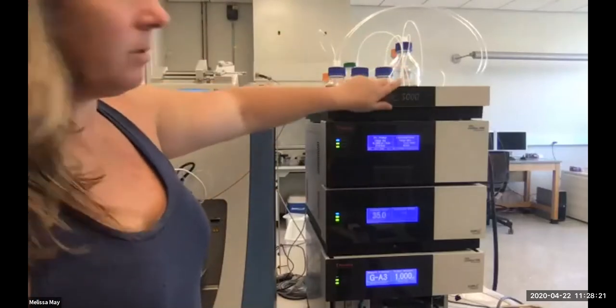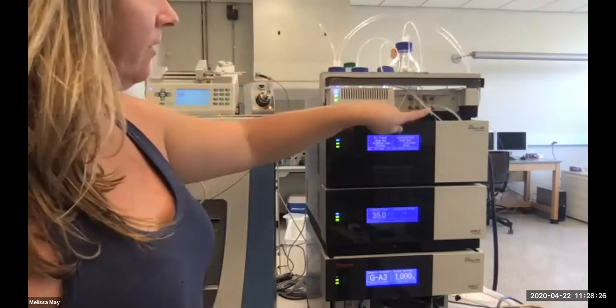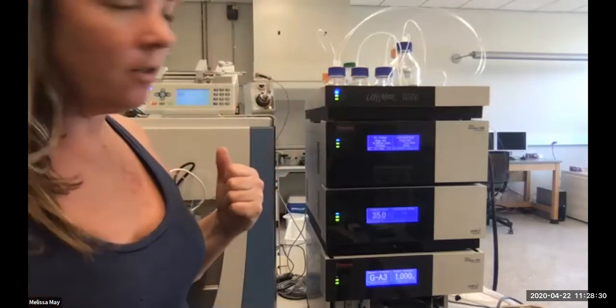Some of these are hooked up to the degasser, this top portion, where you can see that there are various lines coming in and going out. That helps to eliminate any bubbles that are in the line.